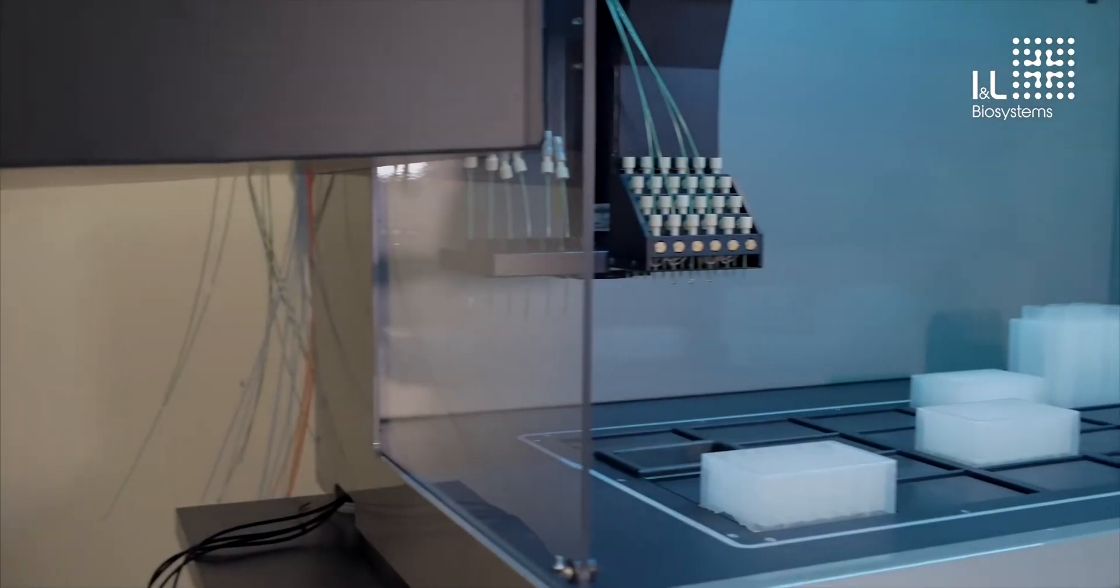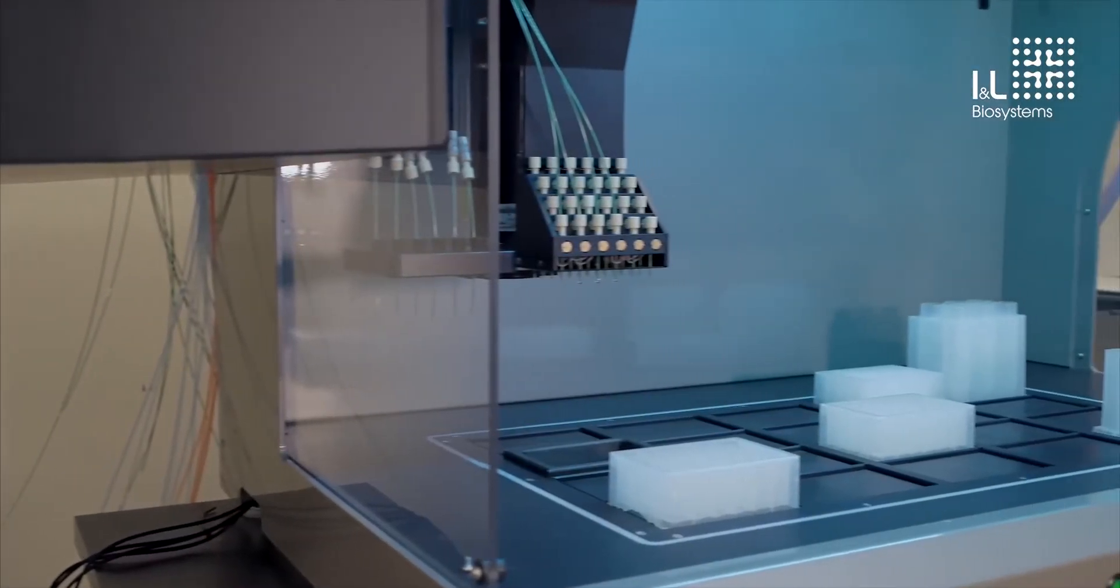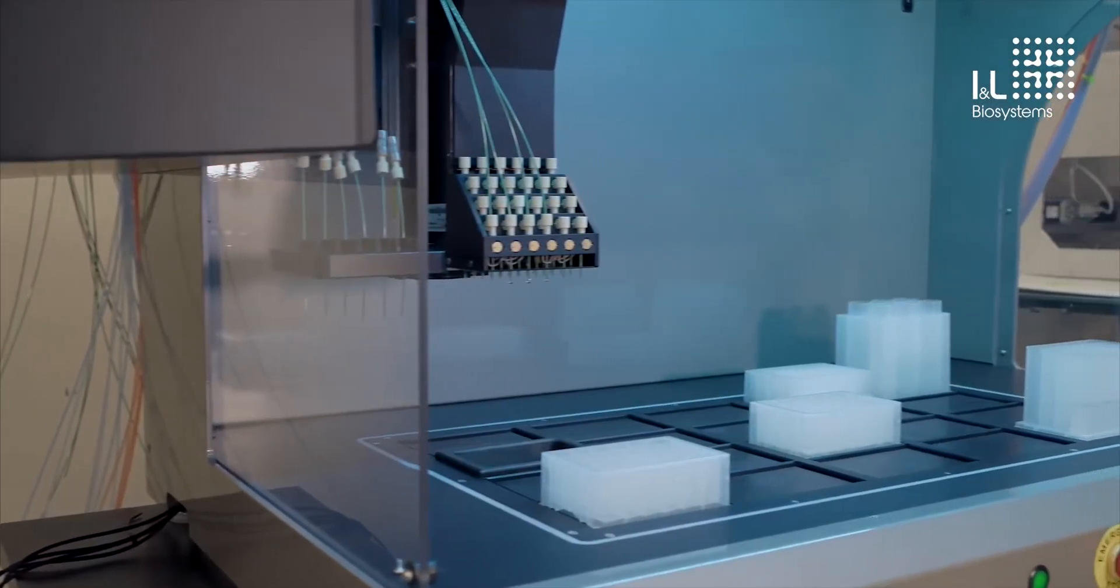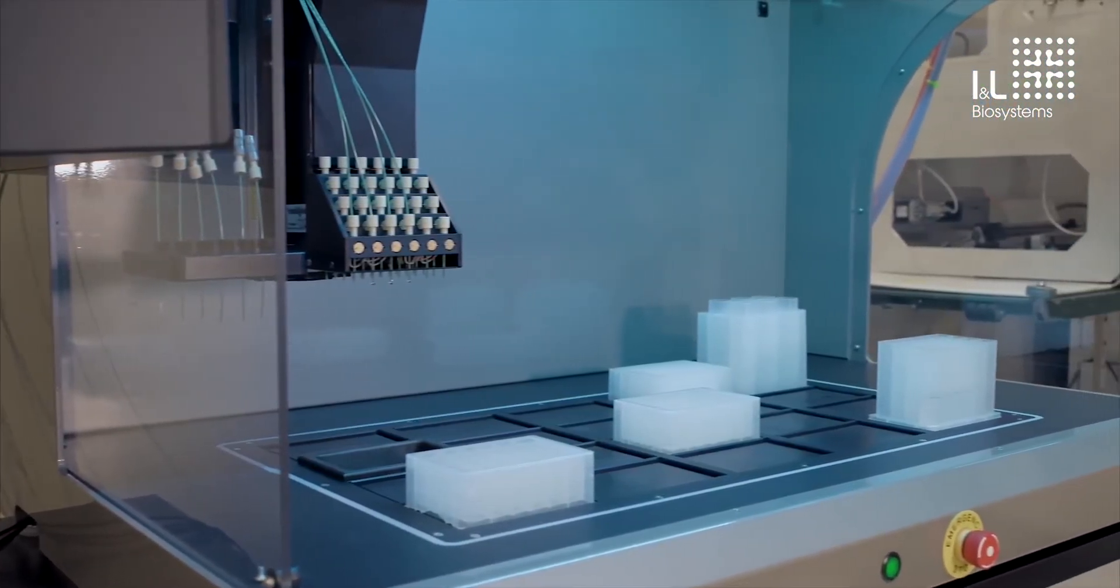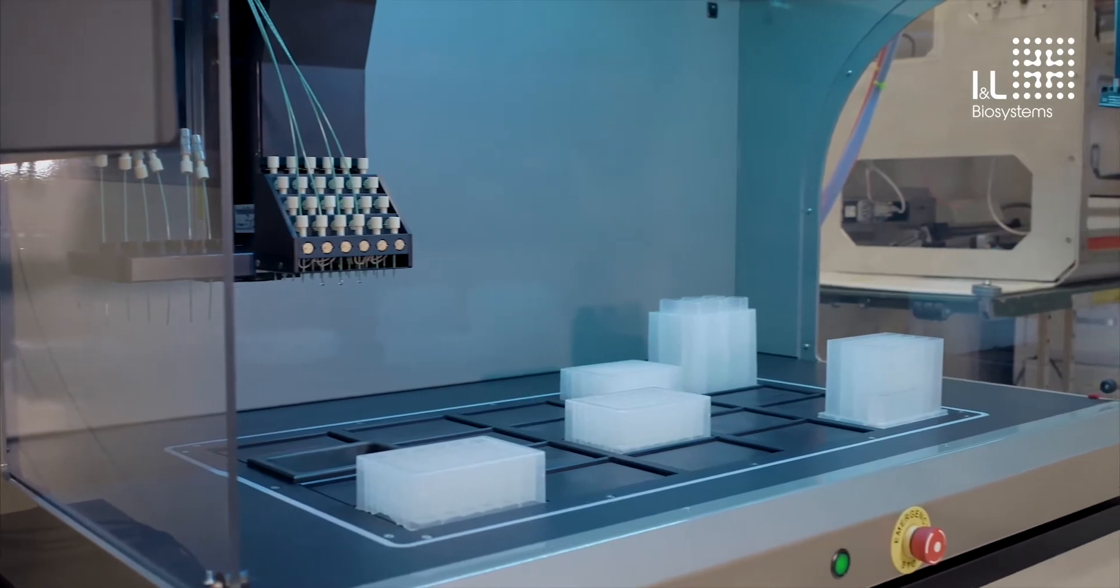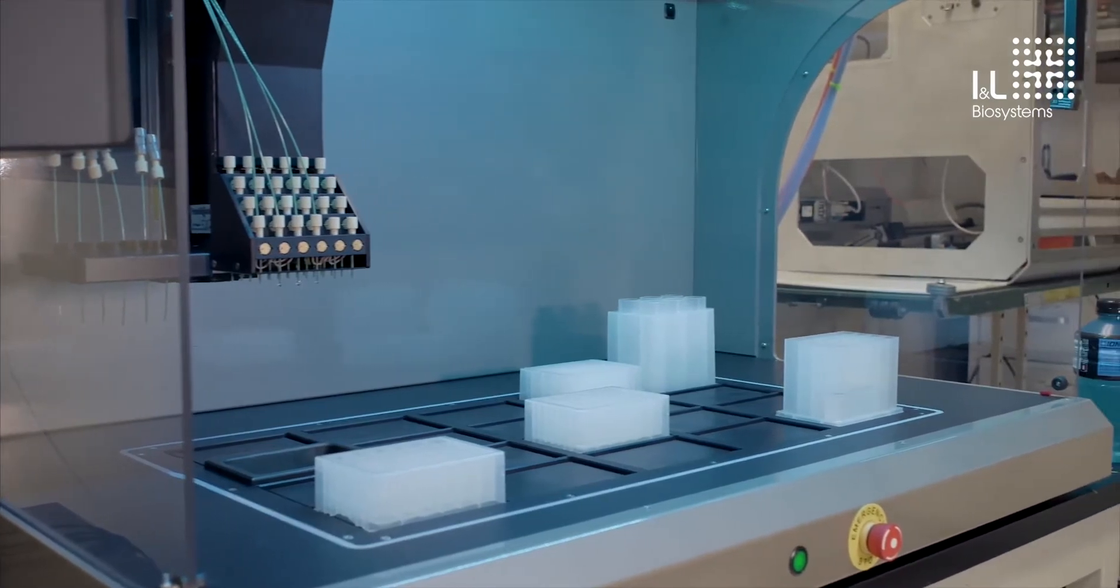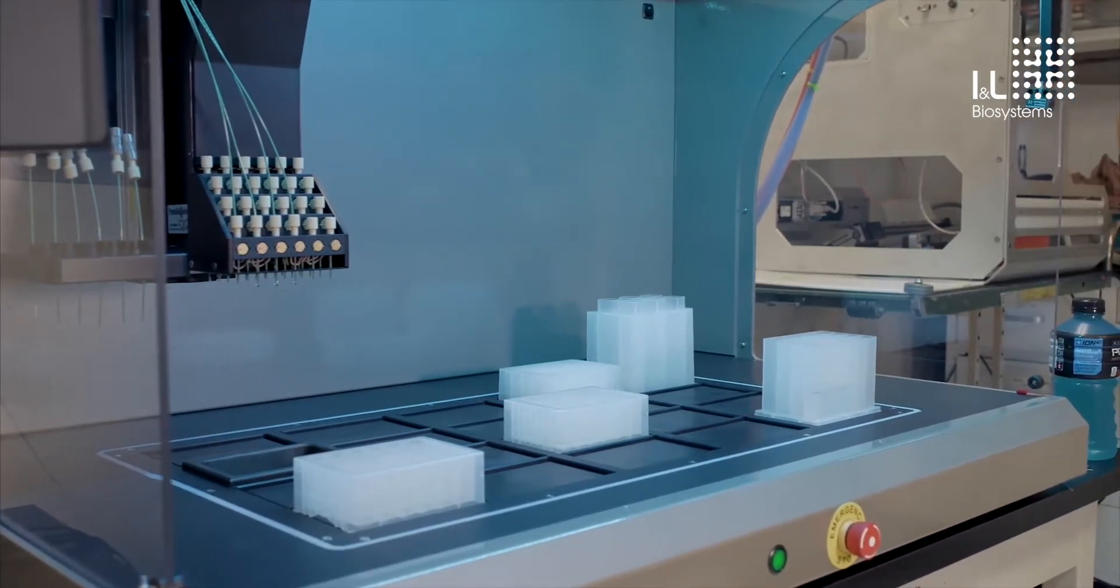Welcome inside the laboratory at Protein BioSolutions. This is the Protein Maker, designed for parallel purification of 24 proteins simultaneously.